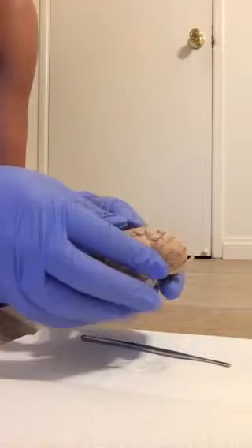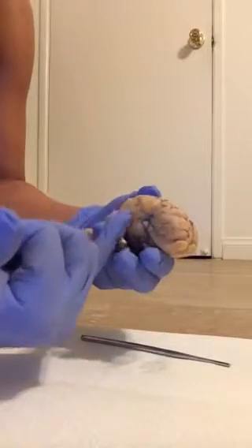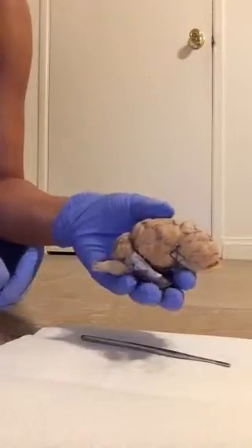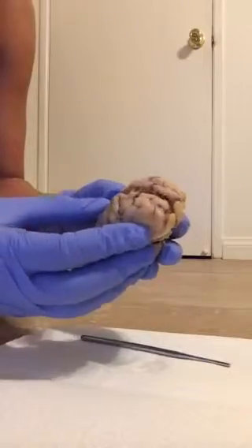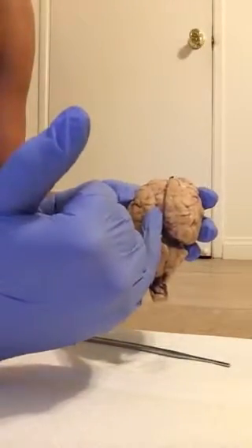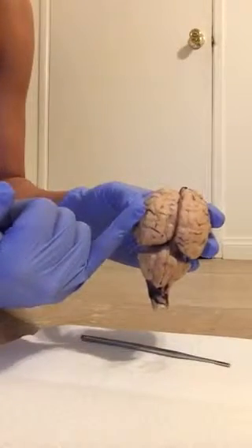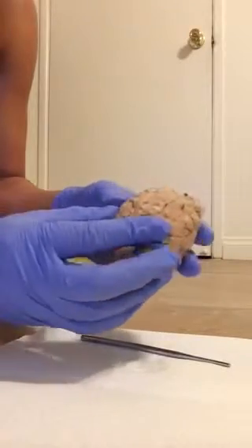I'll start on the gross anatomy of the sheep brain. I'll point out the frontal lobe here. We have our temporal lobe here, our parietal lobe here, and our occipital lobe in the rear. Each hemisphere is separated by the longitudinal fissure, so we have our right and our left.